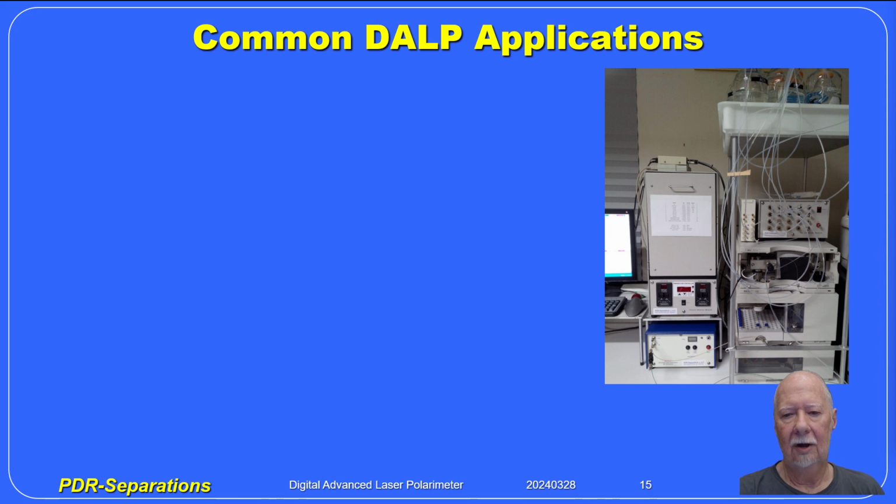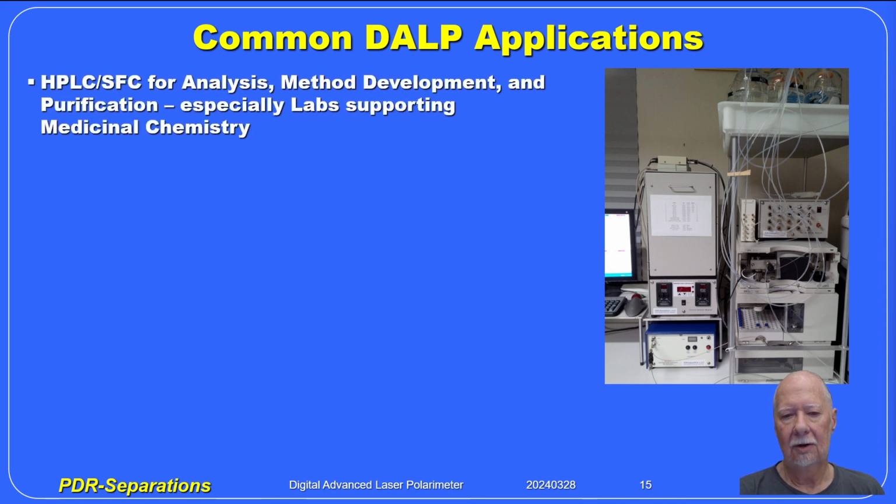Common Dalp applications: in HPLC and SFC for analysis, method development, and purification, especially in labs supporting medicinal chemistry.